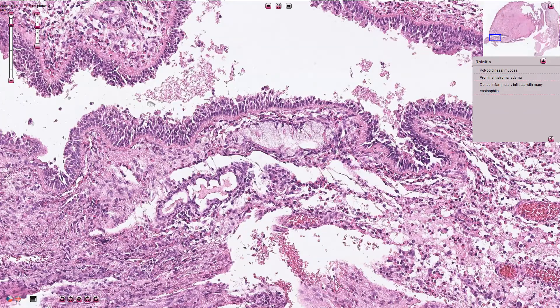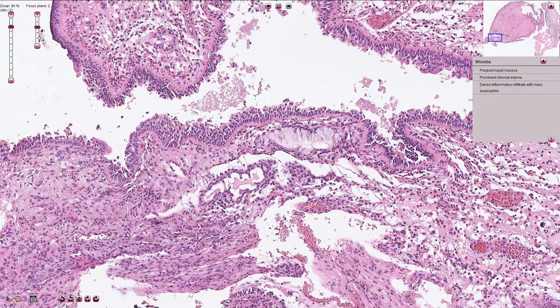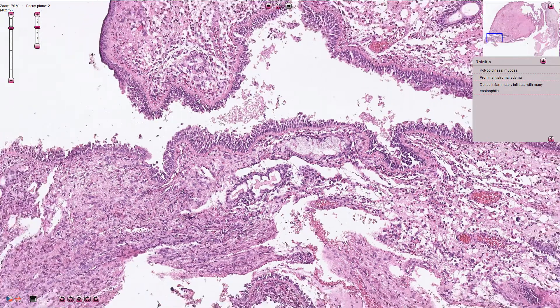In this part of the slide we can see the mucus glands and also quite prominent thickening of the basement membrane. Nasal polyps have a very similar microscopic appearance. They are usually larger and they have prominent mucus glands, hyperplasia, and also more prominent edema of the stroma.